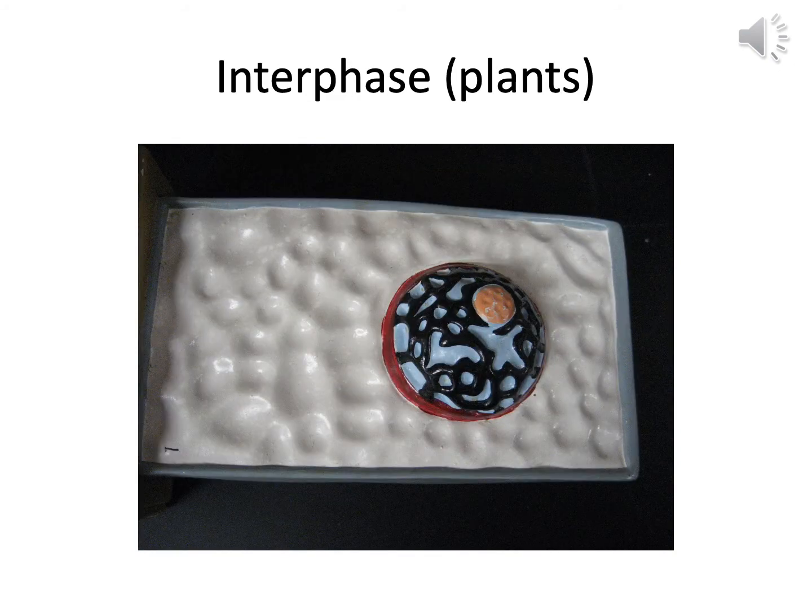The following cells represent plant cells. Note the rectangular shape on these, whereas we had the round shape on the cells before. Interphase in plants is going to be fairly similar. There's still a nucleus that's distinct in the middle. The chromatin is present, although it's in black chromosomes, or chromatin this time. The chromosomes will replicate, so there'd be 2 copies of everything. The nucleoli are visible. This one's more of an orange blob than a little red dot, but the nucleoli are visible.